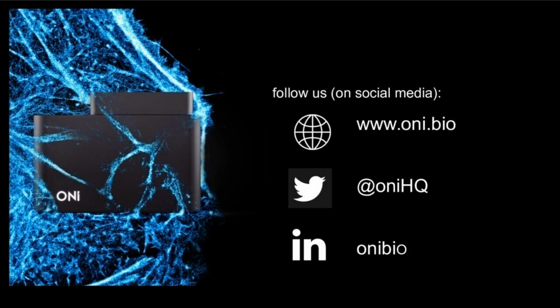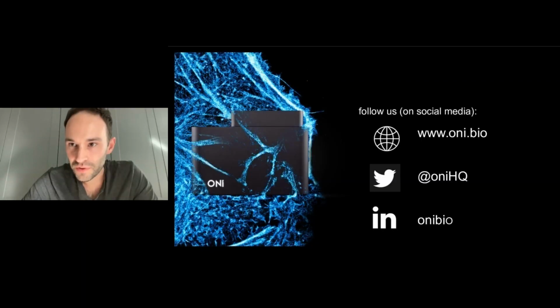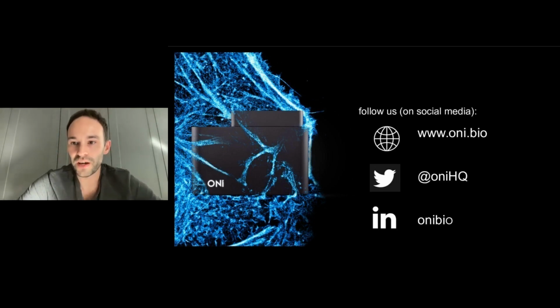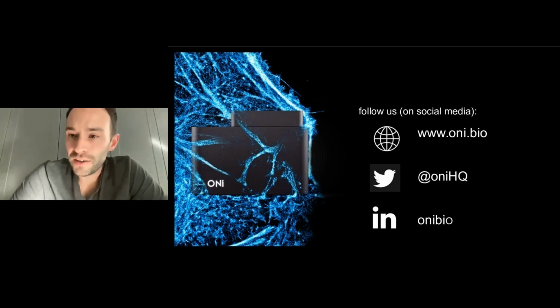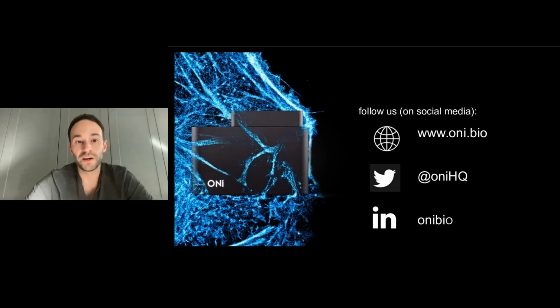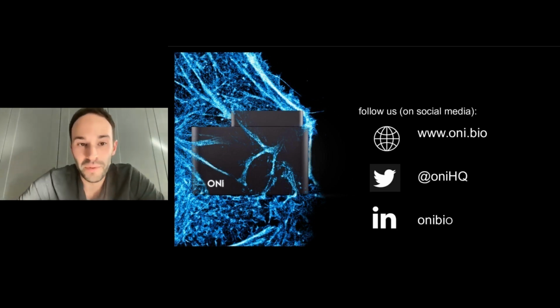Let me see. So we have a question here, which is, can you use lipid dyes for the imaging of extracellular vesicles? You can. It is somewhat challenging, and there are considerations that have to be had. One of the things is that generally lipid dyes form micelles, which are about the same size as the EV. Often these micelles are 20 to 30 nanometers in diameter. And that causes two problems.